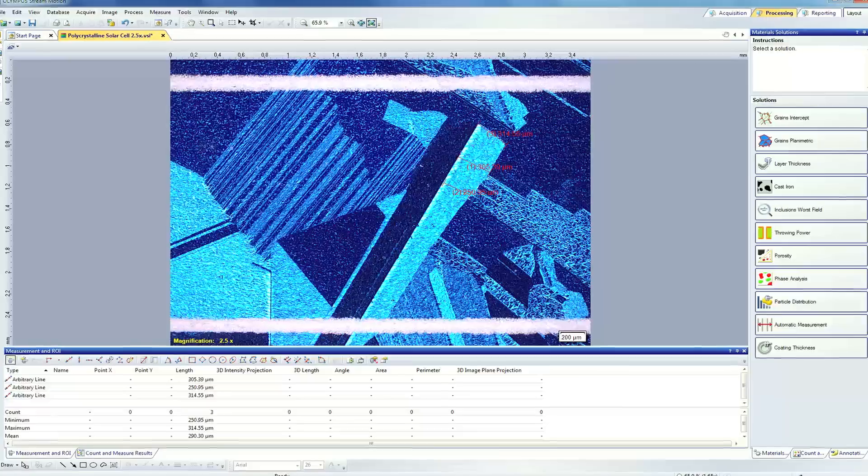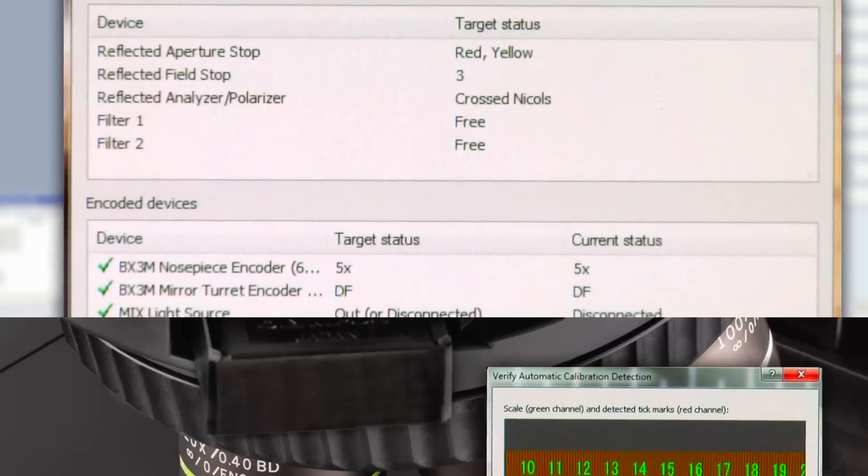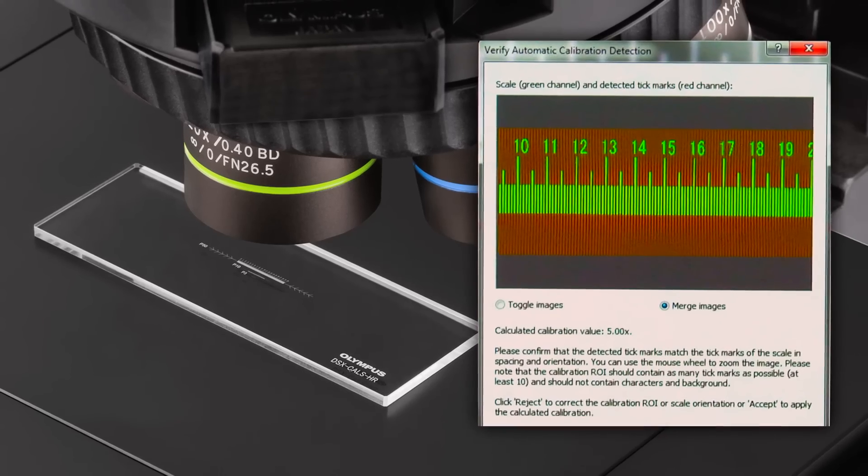New functions in Olympus Stream have improved overall reproducibility and ease of use, such as restore device status and our auto calibration feature.